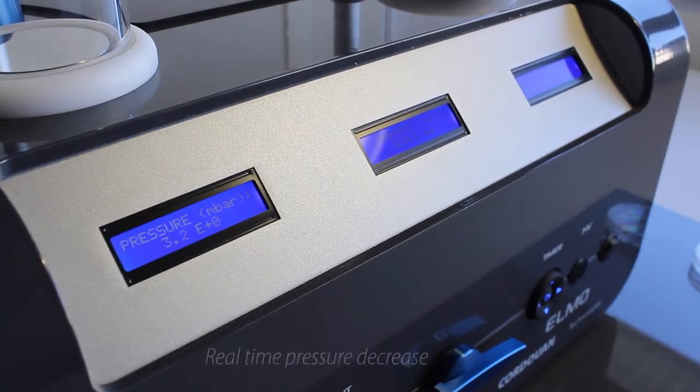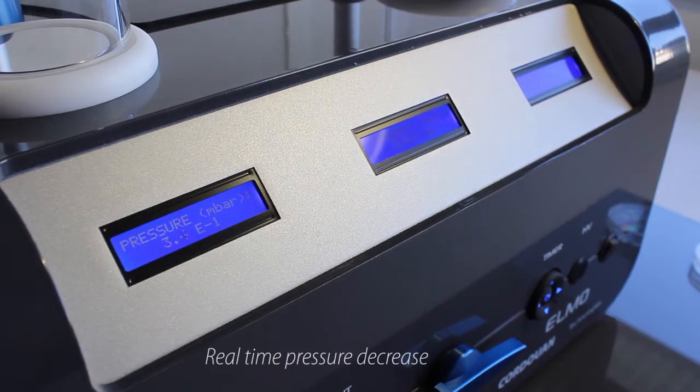Process parameters are displayed in real time. The vacuum level is monitored accurately using a Pirani gauge.